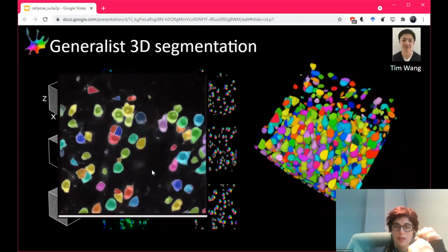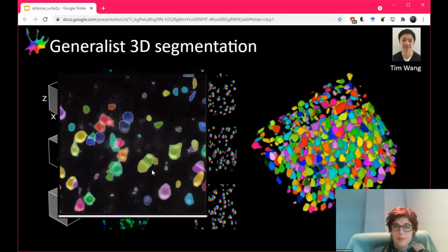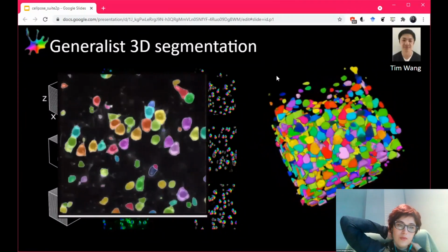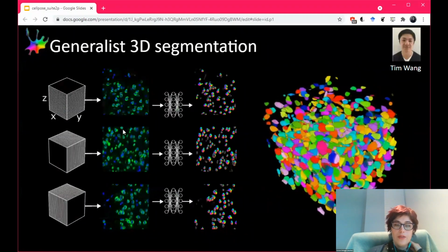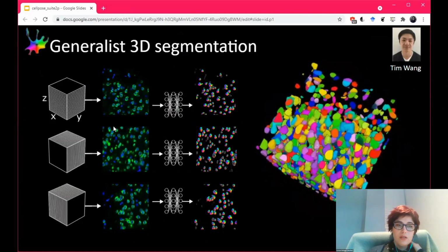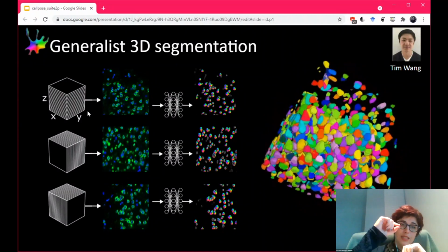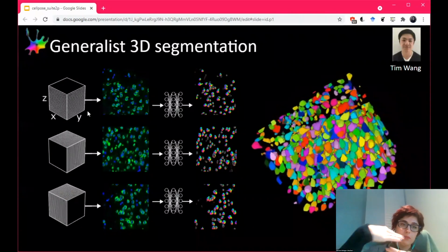And in fact, these cells can be wrapped around each other, and it's able to find these different cell shapes. But I do want to point this out, because this is a commonly asked question on GitHub and in general: if your volume is not very isotropic, say you don't have very fine sampling in Z, it might not be so helpful to use the 3D information to do the segmentation. In fact, it might work better to run the segmentation in XY, get the masks there, and there's a stitching option in Cellpose, where you stitch masks across planes.